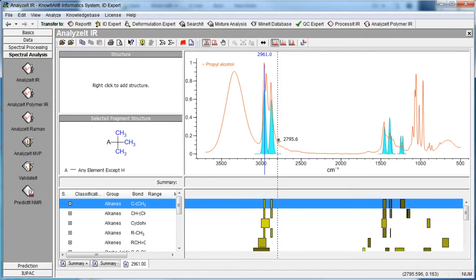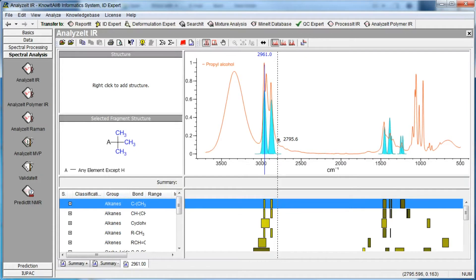The functional group bands are shown in blue with a rough approximation of their width and height. You can also display a reference spectrum for the selected functional group, if desired.